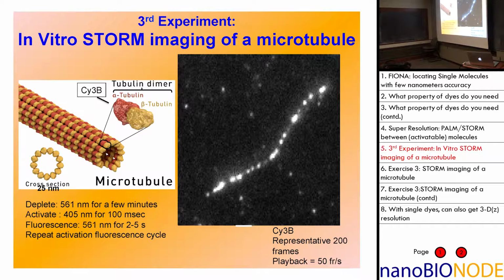However, if this will be, let's say, 350 nanometers, it'll tell you that, in fact, you're probably not seeing just one of them.